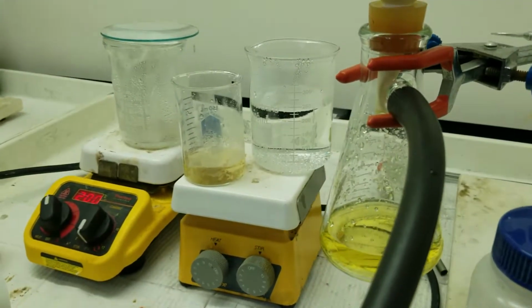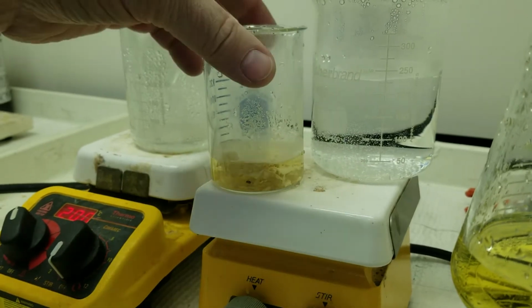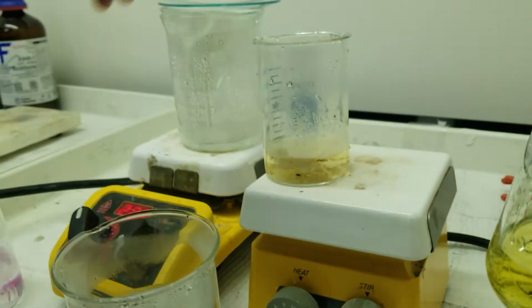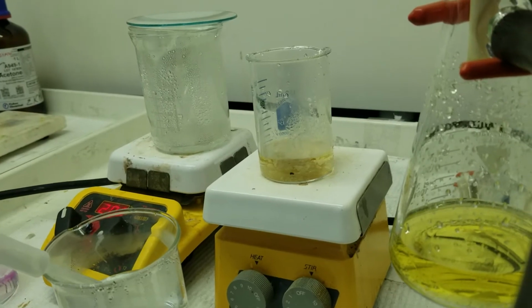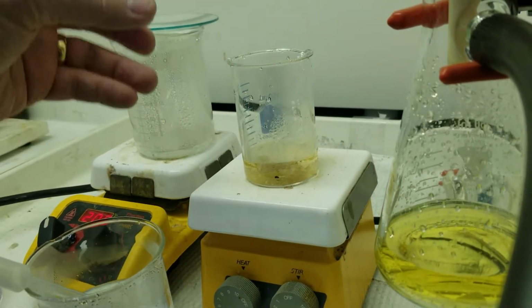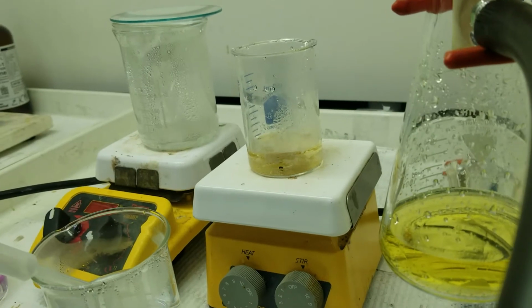Can you see that? Yeah. Okay, it's time to boil. So I'm going to switch places with my boiling water to this one. And ideally, once it boils, all the solid will dissolve. The colors will kind of coagulate as oils on the bottom. And we will see that in just a few minutes, as soon as that water boils.